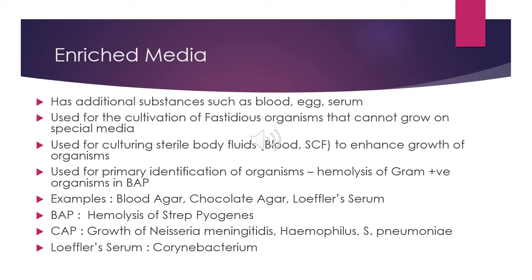Examples of enriched media, as we have mentioned, are your blood agar plate, your chocolate agar plate, and the Loeffler serum. The blood agar plate usually exhibits hemolysis of your Strep pyogenes. Your chocolate agar plate supports the growth of your Neisseria meningitidis, your Haemophilus, and your Streptococcus pneumoniae.